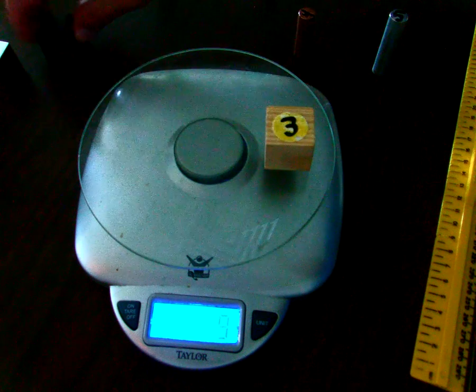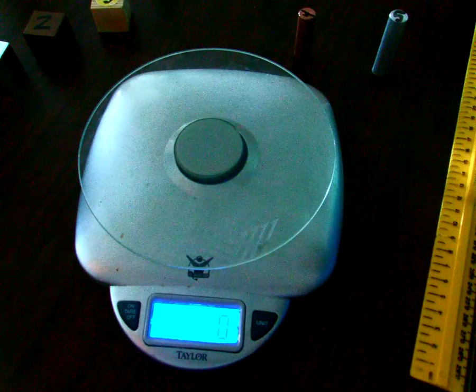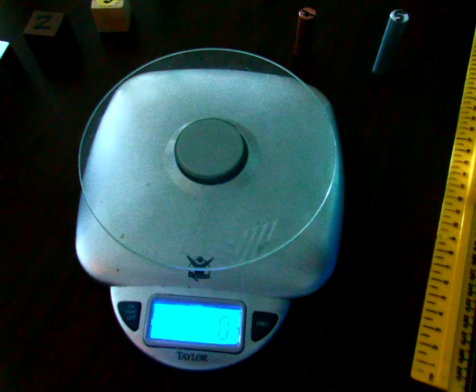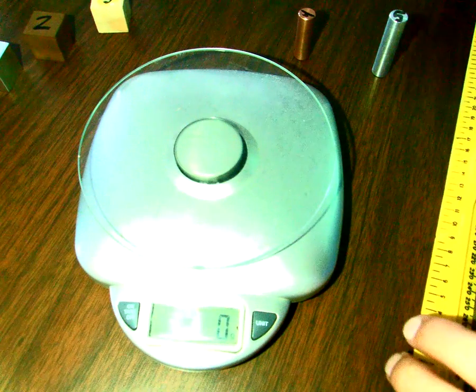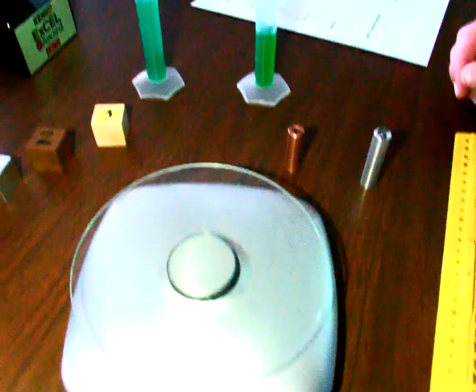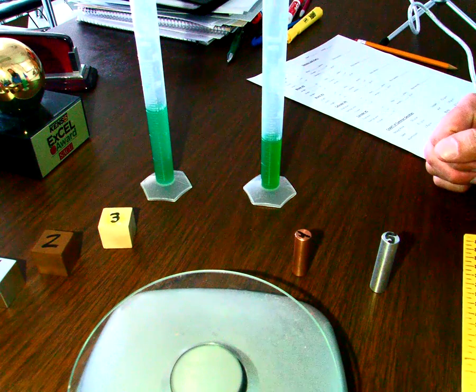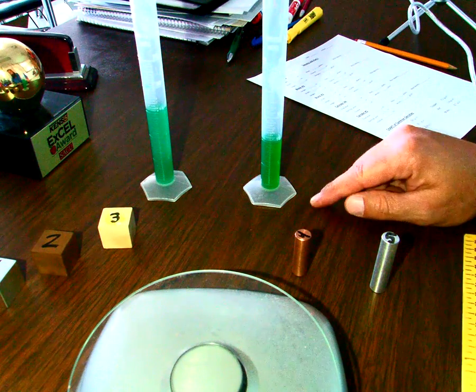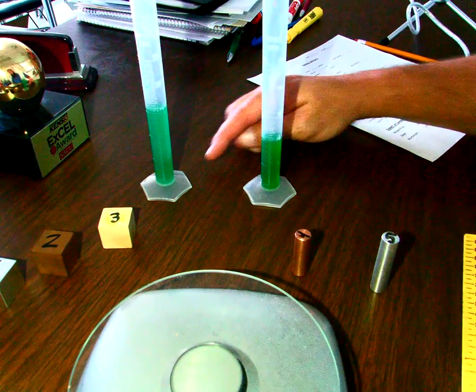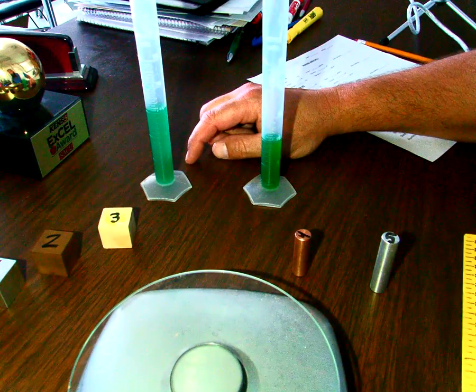So that's the block portion, or cube portion, of our density lab. Now what we're going to move to is how to find the volume based on water displacement. We're going to be using these 2 graduated cylinders. In this graduated cylinder on the right, there is 10 milliliters of colored water. And this graduated cylinder on this side, there's 15 milliliters of colored water.